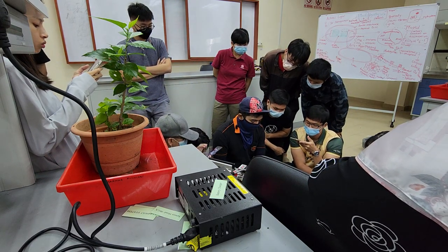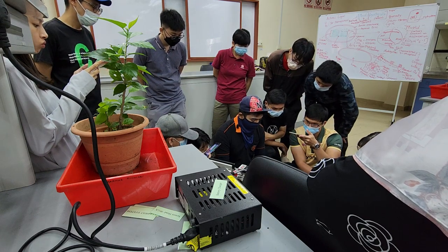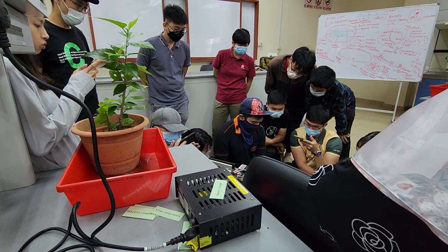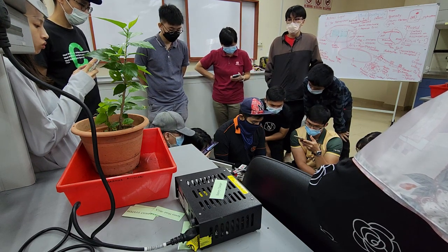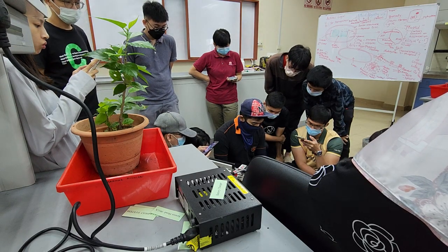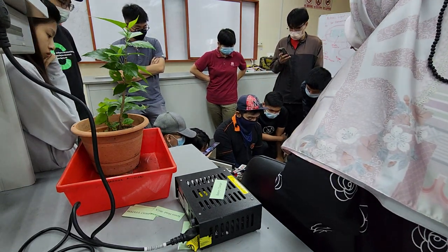So I just set the CO2 to 400 ppm. Reference CO2R, meaning that we send the command from the console to give 400 ppm worth of CO2 to this chamber. Look at whether it's going to increase. It's alright, just for the class, we'll do this. I'll check this procedure later. So you need to wait for the CO2 reference to become 400 and CO2 sample to become around 400 as well.